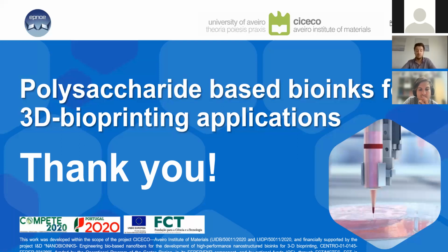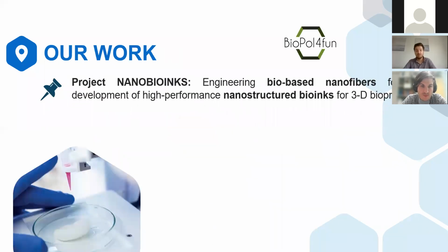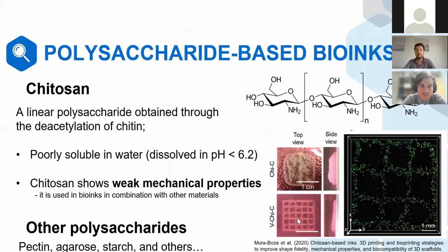Right now, what we do when we want to test is print one of those little models. I think I had an image somewhere around here. When we do 3D bioprinting right now, most of the time we print something like this, a defined structure.